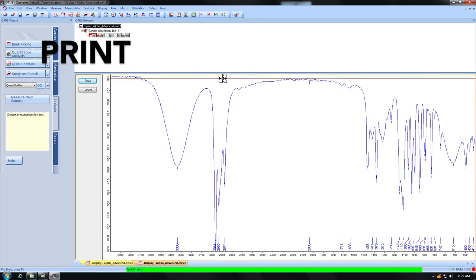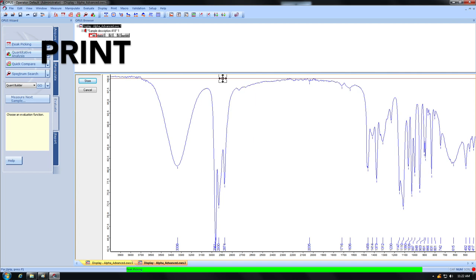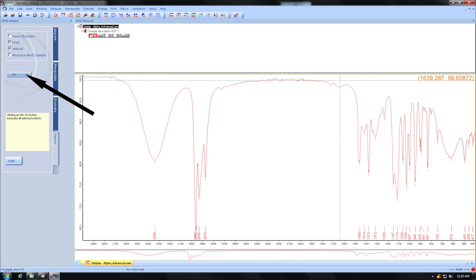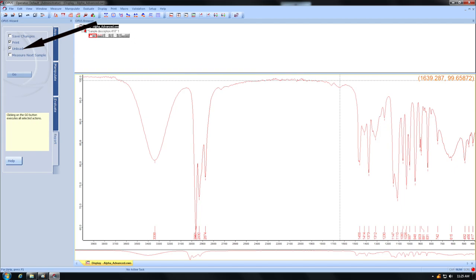If you want to print your spectrum with the labels, click store. You can now print your spectrum by checking the print button and clicking go. The unload button should also be checked so that the display is cleared for the next person.